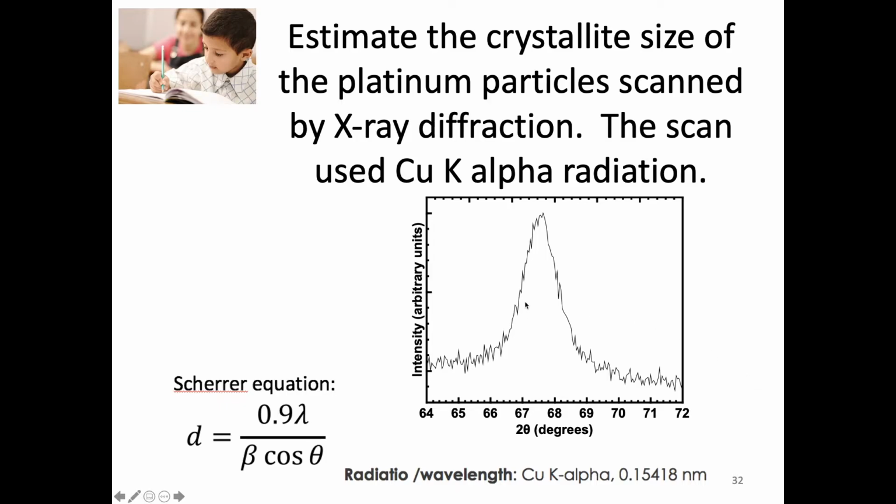So if you want to go and look at this image in ImageJ, that is perfectly fine. If you want to do it with PowerPoint just to get a rough measure of this, you can use this as your scale bar to get the width and everything. So use your degrees down here, and then see if you can come up with the diameter, and then we will come back and take a look at what I have. So pause that and see if you can work through that problem, and then come back and we'll see what particle size we get.